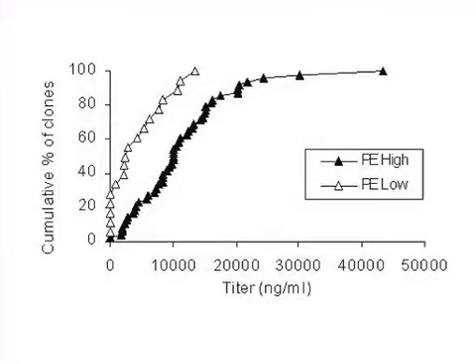For example, in this experiment, this ELISA data will be used to determine which cell lines produce the human antibody with the highest affinity for, that is, best ability to bind accurately to, its target antigen.